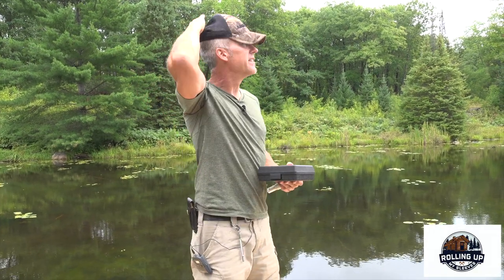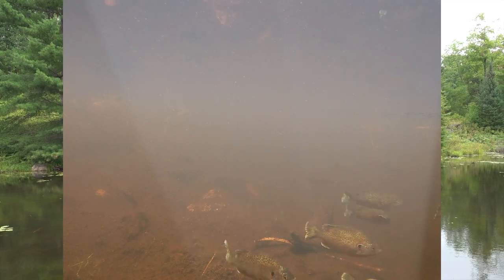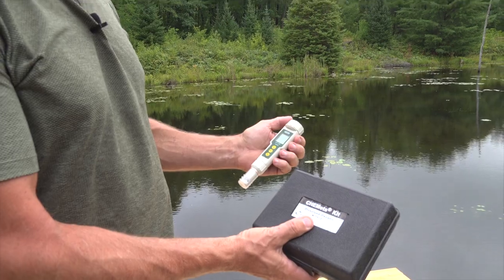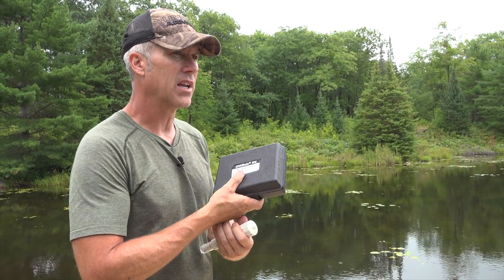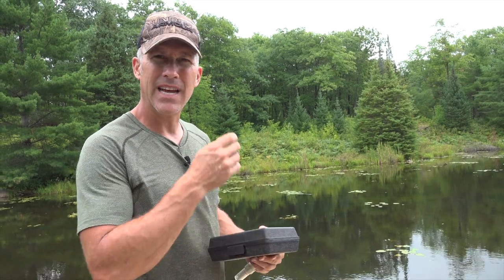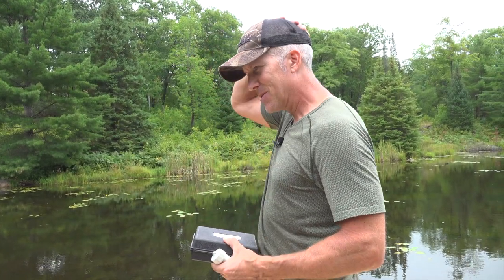We're back here at a little tiny lake. The other day we swam this lake and didn't see any fish, but then we built our dock and we saw fish. I'd already purchased this dissolved oxygen kit, a ChemMets kit, and this little Dr. Meter pH tester. I'm going to go around and hit a bunch of different little lakes and ponds on our property to compare water quality and pH, and we'll look up what kind of fish like what kind of water. It's kind of new to us, so when I do things to learn I might as well pass that on.